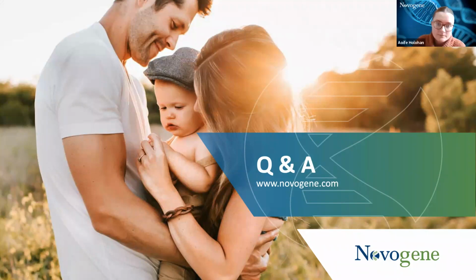Next question is from Tom saying, can I specify a different software to be used for analysis? Okay, since this question didn't specify NovoMagic or not, I'll just answer both.